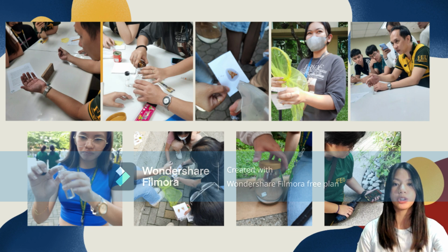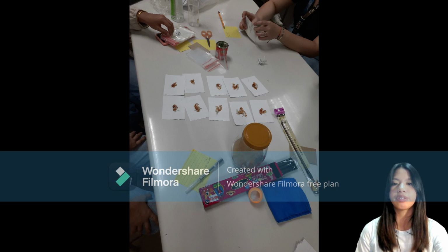You can set up traps to attract or intercept insects. Some common traps include light traps that attract nocturnal insects, sticky traps to catch flying insects, and baited pitfall traps to capture ground-dwelling species. Additionally, there are baited traps that utilize a range of attractants, such as tuna, peanut butter, seeds, and dead insects, among others. These baits are strategically placed to entice insects, making them a part of the collection without any physical intervention. The choice of bait can be quite diverse and often depends on the specific insect groups being targeted.